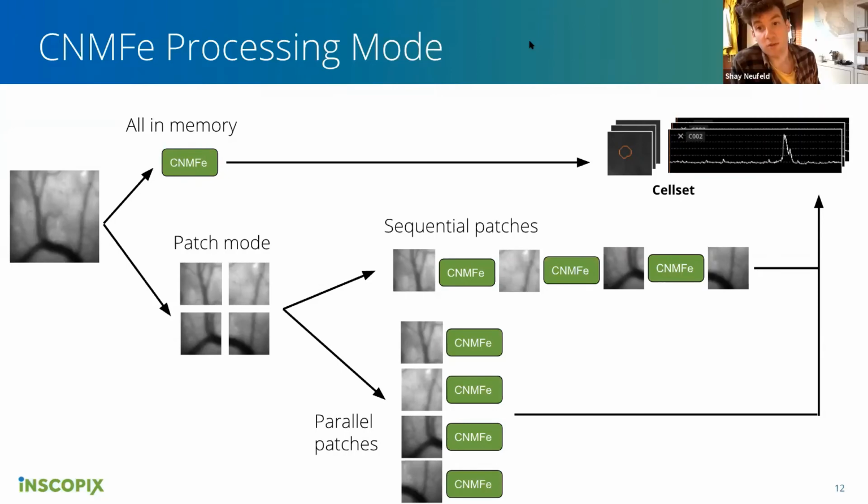Downsampling the movie is great, and we recommend doing that in general. But of course, if you're trying to tune your parameters, then you don't want to tune them on something that's downsampled differently than what you want to run the whole thing on.